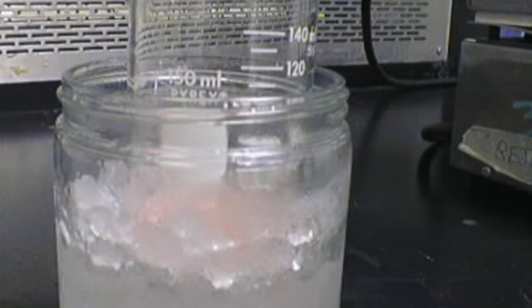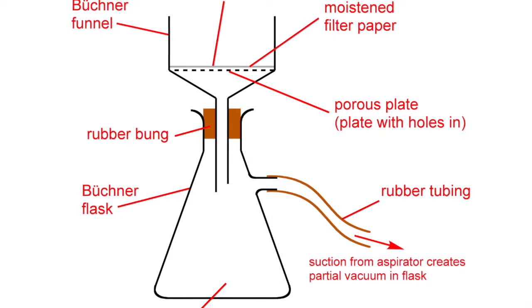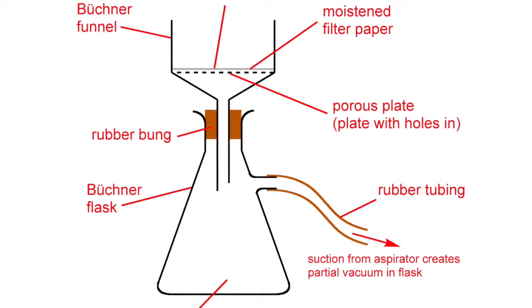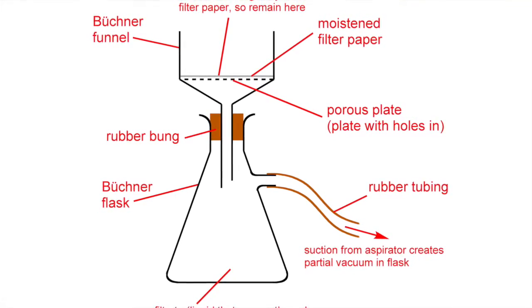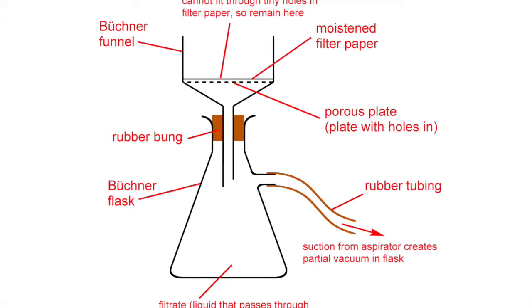These crystals were then separated from the liquid around them through vacuum filtration and were washed with a mixture of cold ethanol and water. This specific fluid was chosen to wash the crystals because it prevented the greatest amount of unintentional dissolution. A mass of the solid alum was weighed and added to 40 milliliters of water to create a saturated solution to put into the vials for crystallization.